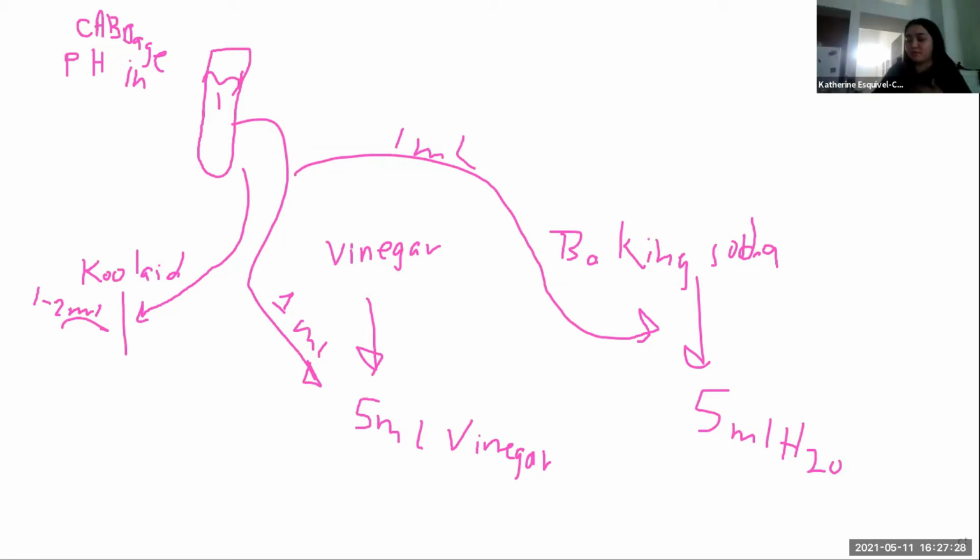Dr. Henry, I'm having the same problem because I was listening and I was getting so stressed out. I'm still doing the one that she just said, 7 through 10. It's starting to go down, but it went a little bit above the 50. Okay. How many times have you done it? This is my first time, because I was trying to watch everyone. Then do it again. If it goes above 50 the second time, then you're gonna have to dilute it. Okay.